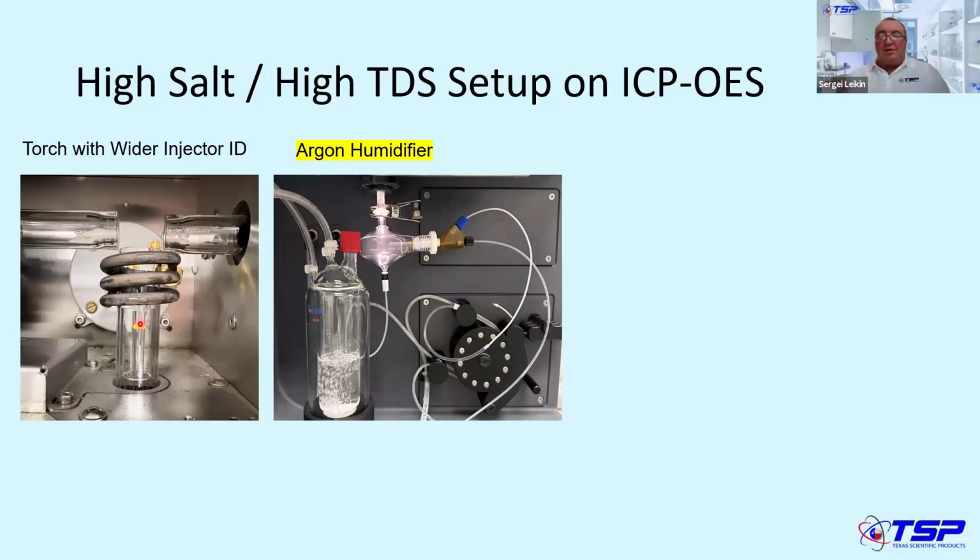And people are struggling because it will salt up any nebulizer, whether it is high solids capable or not. So in order to maintain good health of your nebulizer, the argon humidifier must be in line, which is basically a vessel with different designs. You can see one of those. It will moisturize the nebulizer flow, and it will slow down dramatically what we call salting up of the gas orifice of your nebulizer.